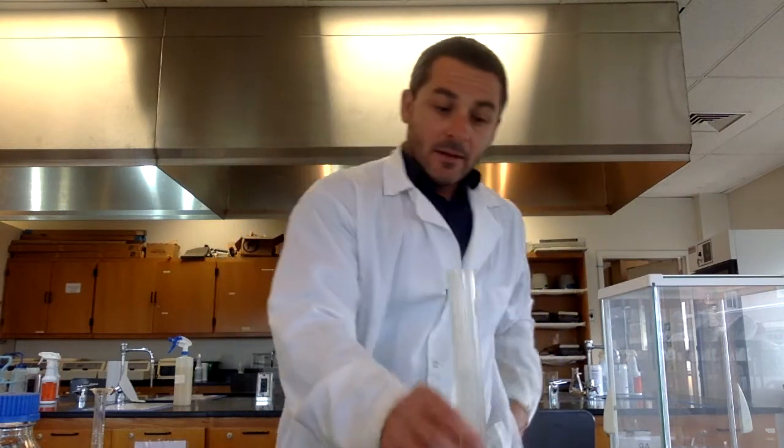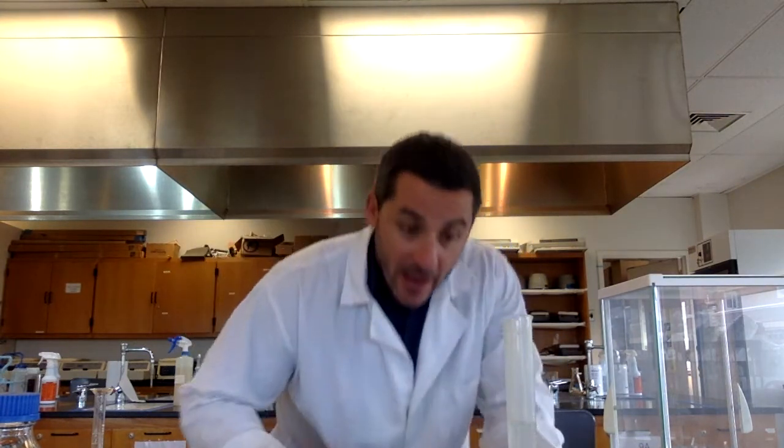Now, when I read the volume of anything in a graduated cylinder or later a burette, the liquid in there forms a meniscus. It sticks to the sides and makes a concave surface on the top. What you want to do is read the bottom of the meniscus, which is right in the middle. So you want to get it eye level.